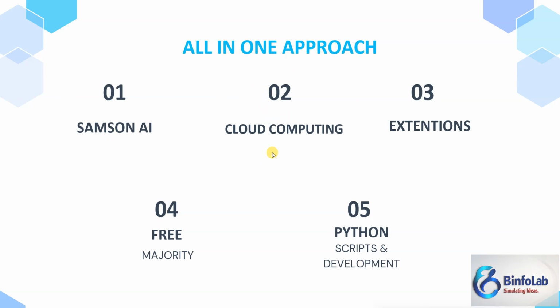Okay. Point two, SAMSON supports cloud computing. It means that if you are doing some heavy work, like simulation or working with bigger data sets, and you want to compute these analyses, for example molecular simulations, you can compute them in the cloud. You don't need to go to other places like Google Colab. Just from SAMSON, just click. You need a few clicks and bang, you can do it.